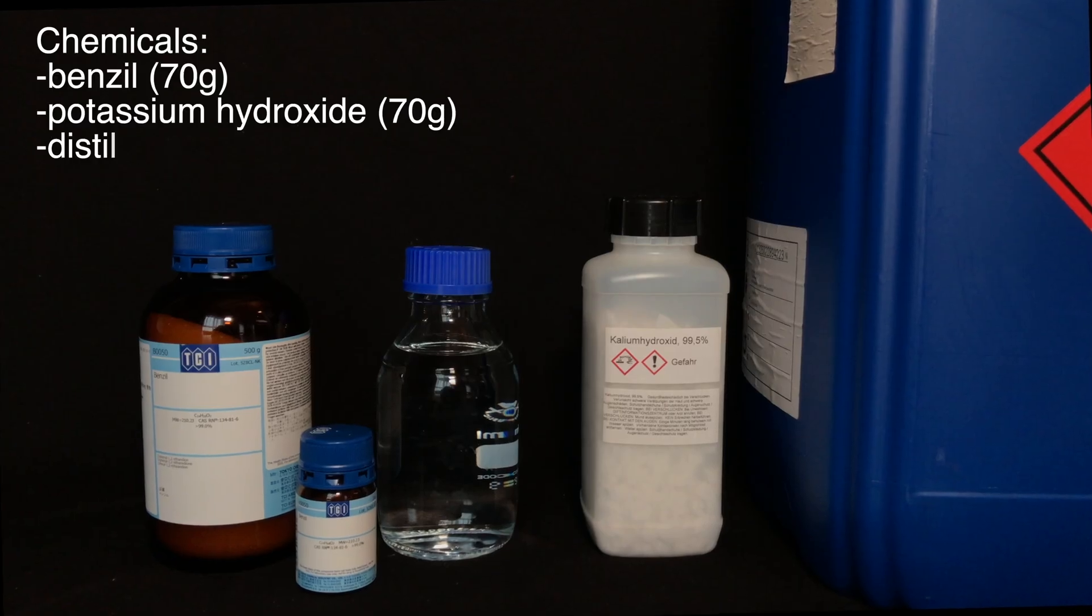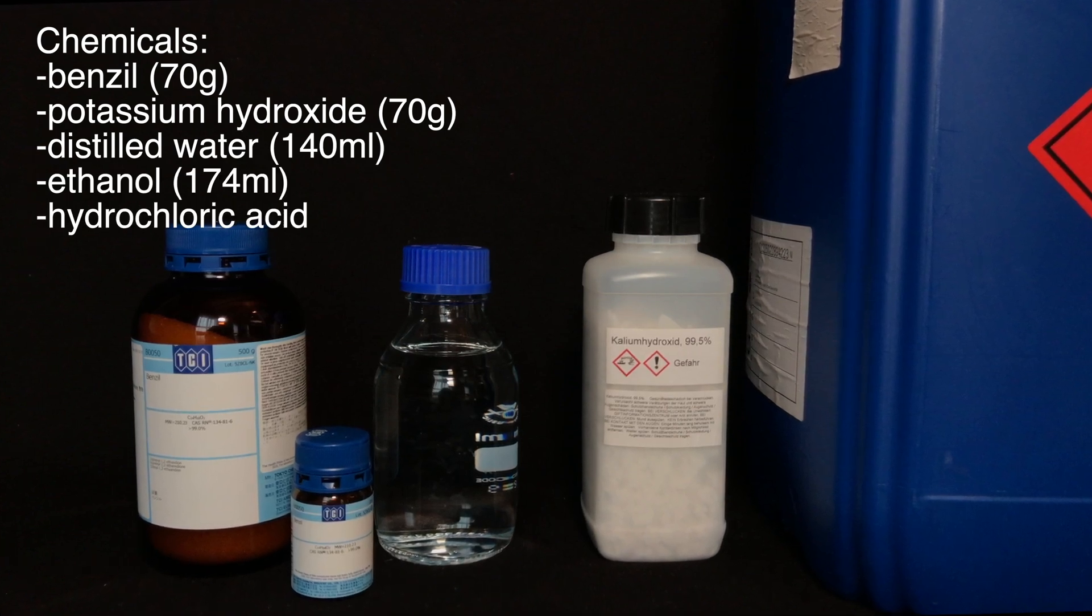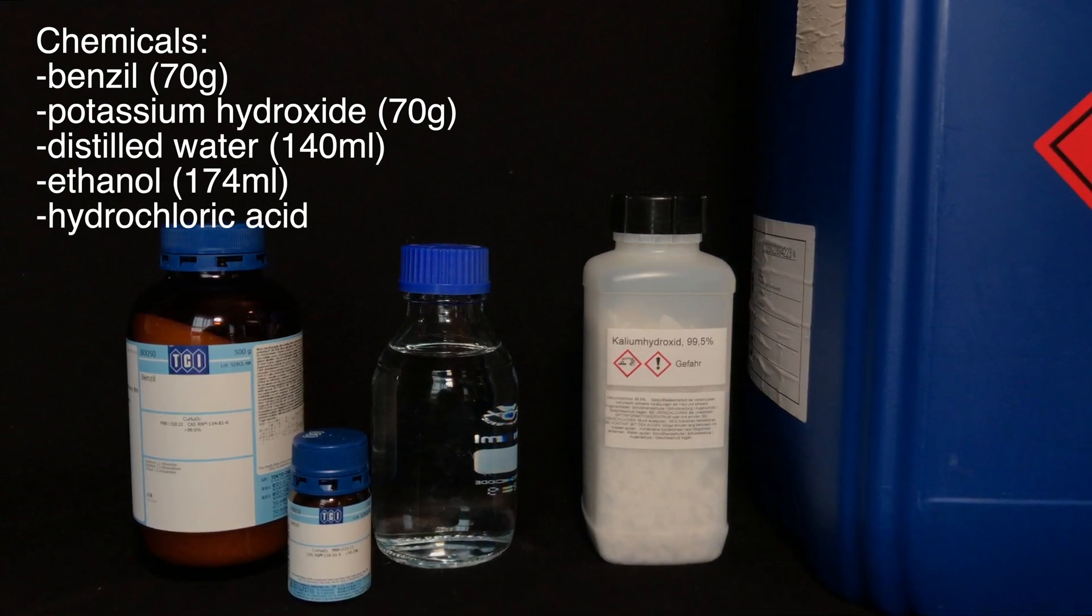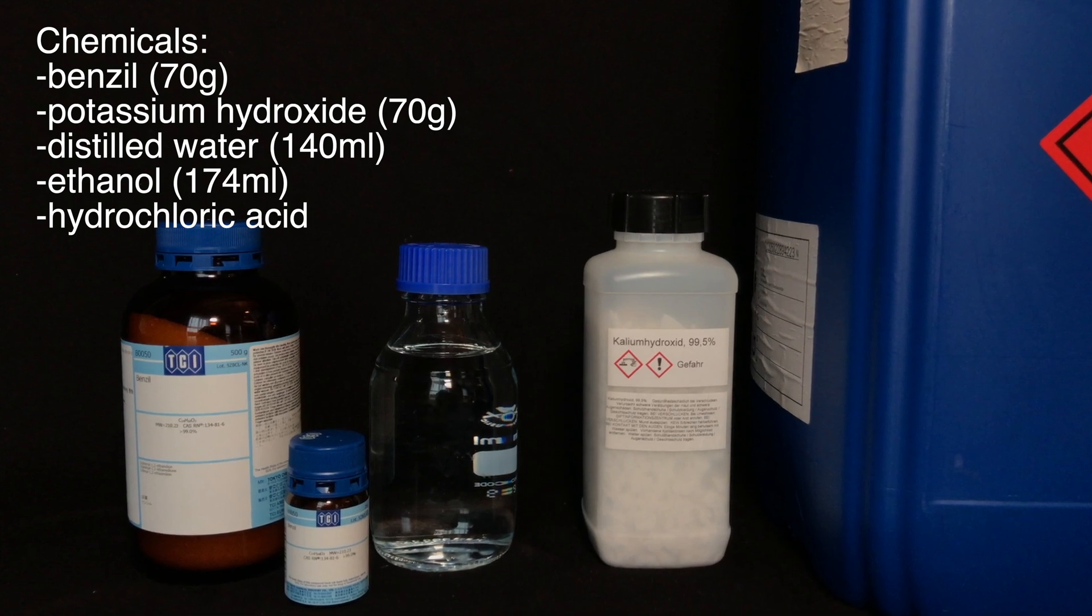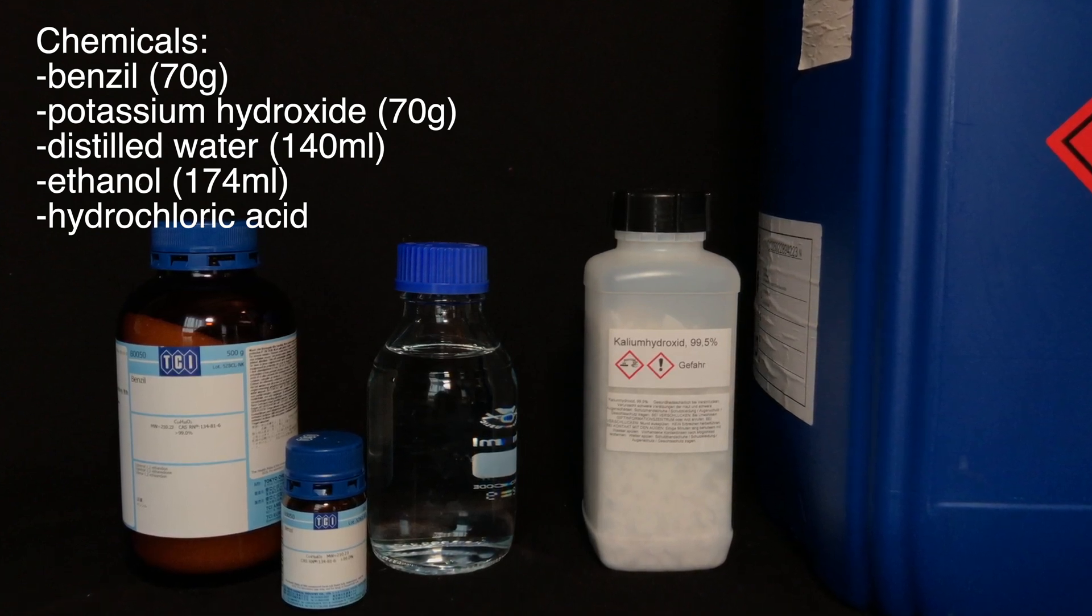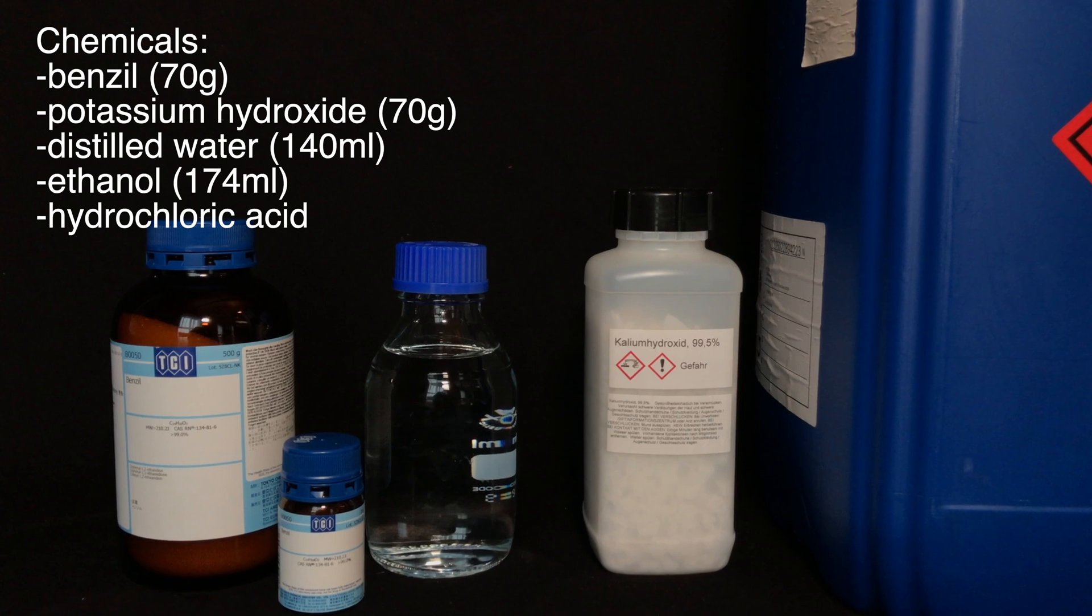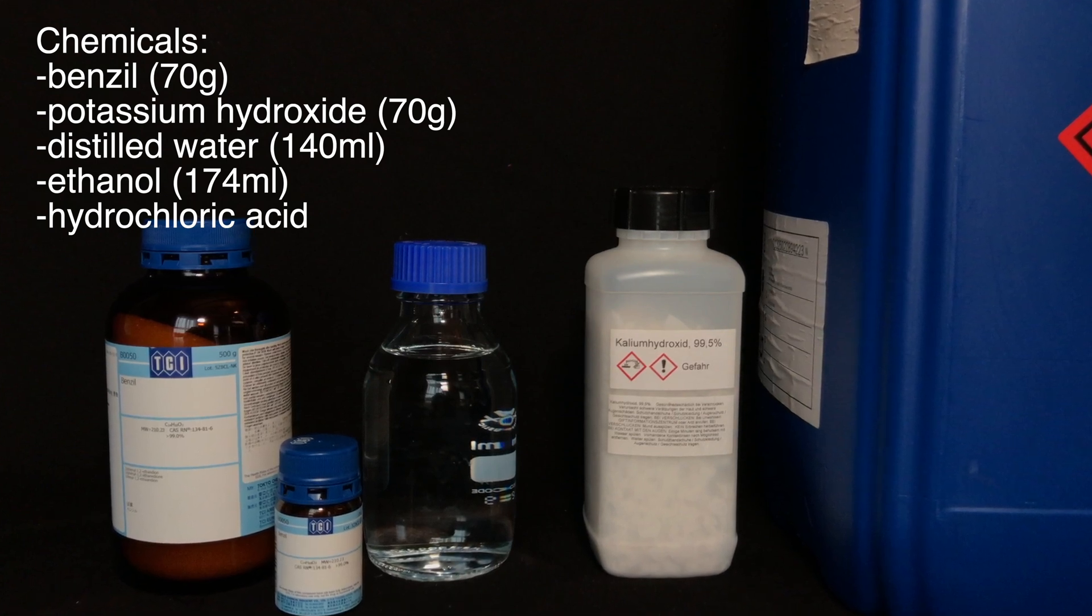For the classic synthesis of benzilic acid you're going to need 70 grams of benzil, 70 grams of potassium hydroxide, 140 milliliters of distilled water, and 174 milliliters of ethanol. We're also going to need hydrochloric acid.